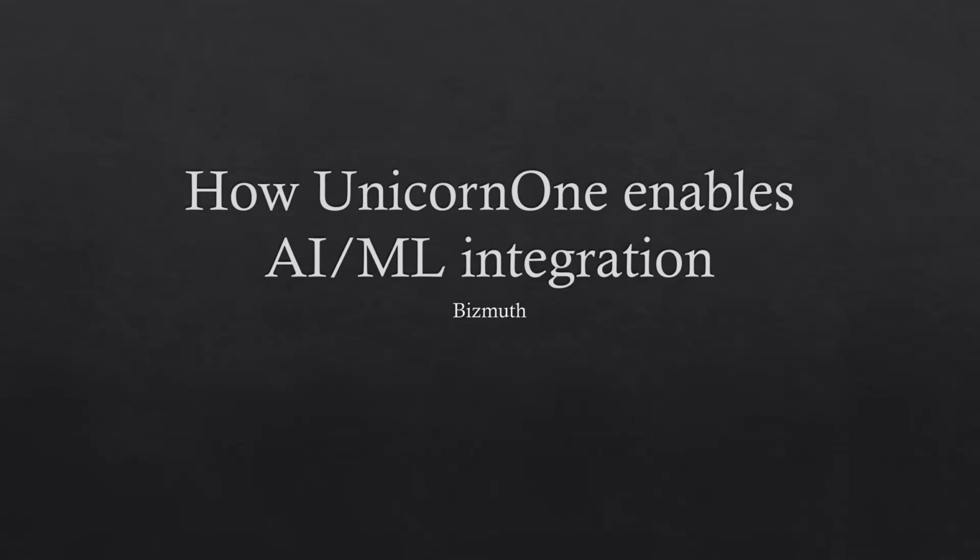It is relatively easy to connect AI models to an individual instrument or build a custom application around a specific experiment. The much harder problem is creating a laboratory-wide software environment where hardware, data, users, and AI can work together without rebuilding the infrastructure for every new application. This is the problem UnicornOne is designed to solve. Before we look at each integration option in turn, let's first explore what UnicornOne is.